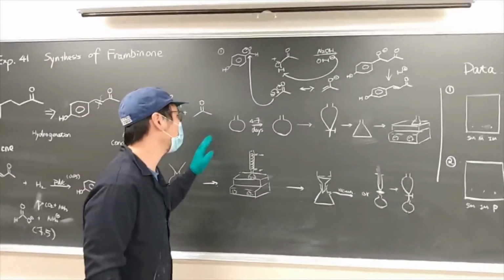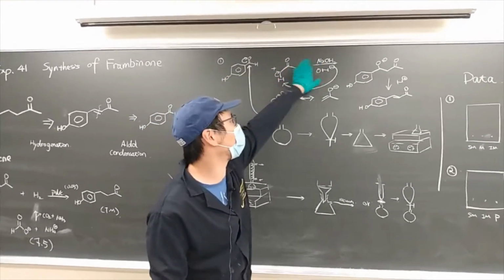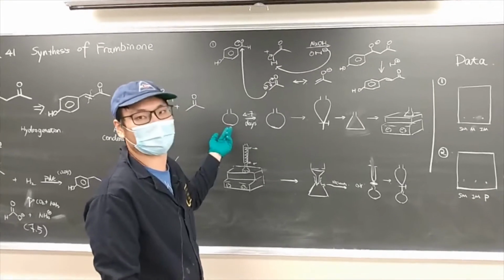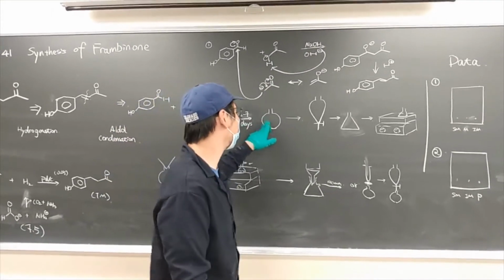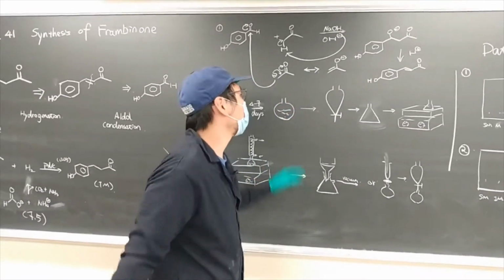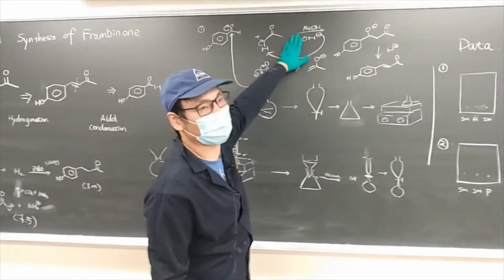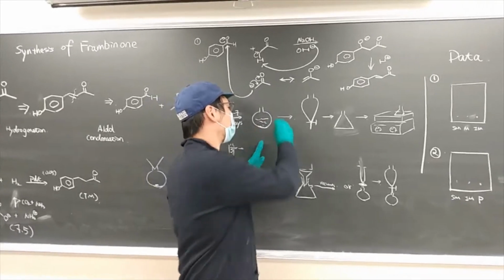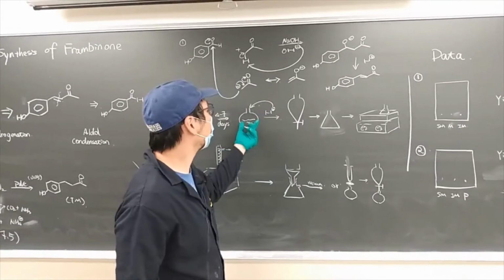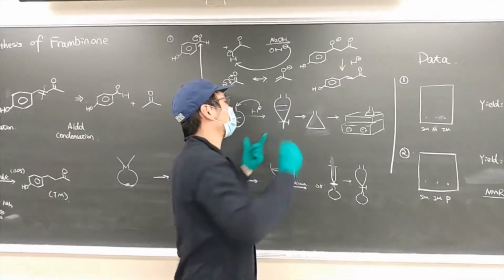And that will be the brief experimental procedure we will do here. We will add all three components, the starting material, the acetone, and the sodium hydroxide, into the flask and let it sit for 4 to 7 days. And we will have the solidified solid here. As we show here, we will have a lot of reactive sodium hydroxide here, so we need to add acid to neutralize it. And then they will go to the organic phase. Two phases, they will go to the organic phase.